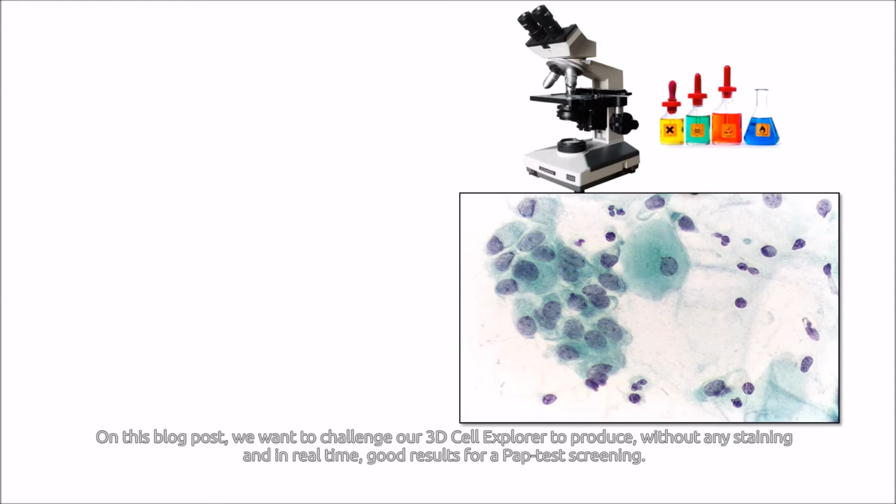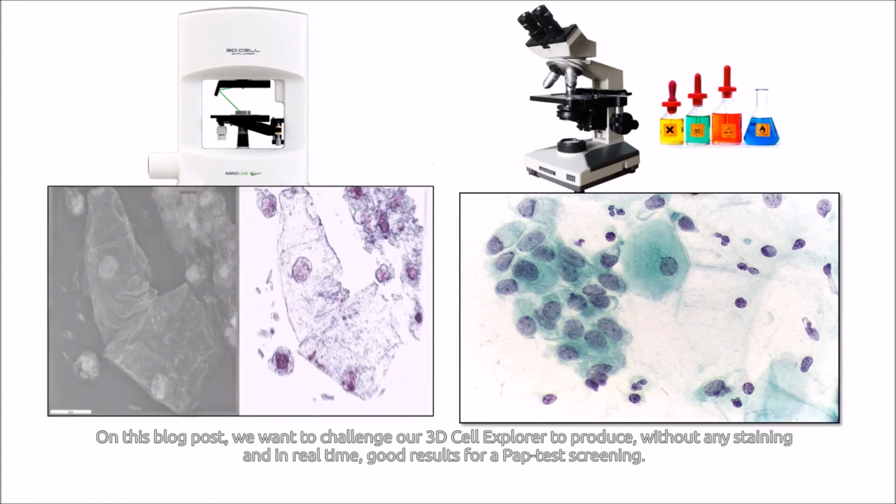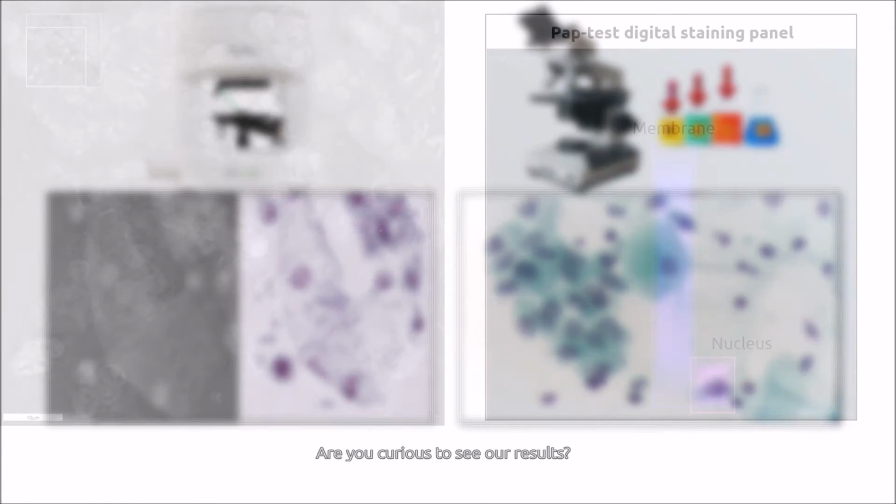protocol. In this blog post, we want to challenge our 3D Cell Explorer to produce, without any staining and in real time, good results for a Pap test screening. Are you curious to see our results?